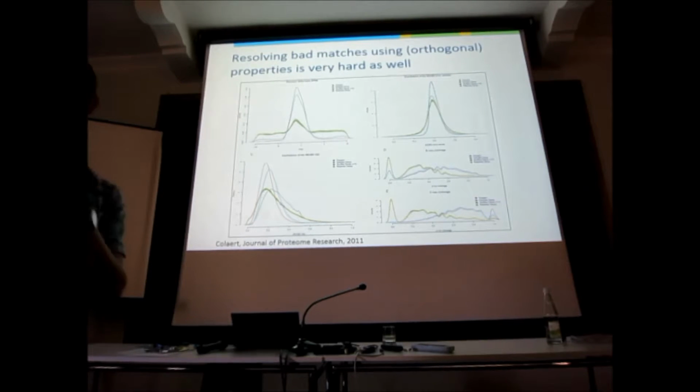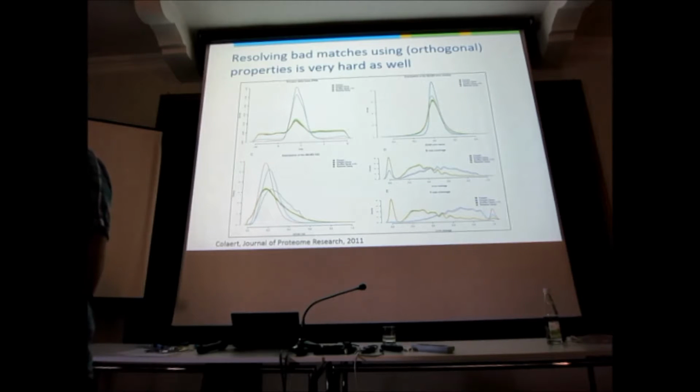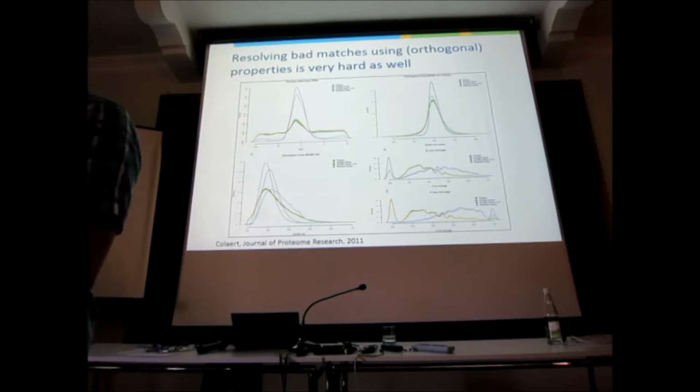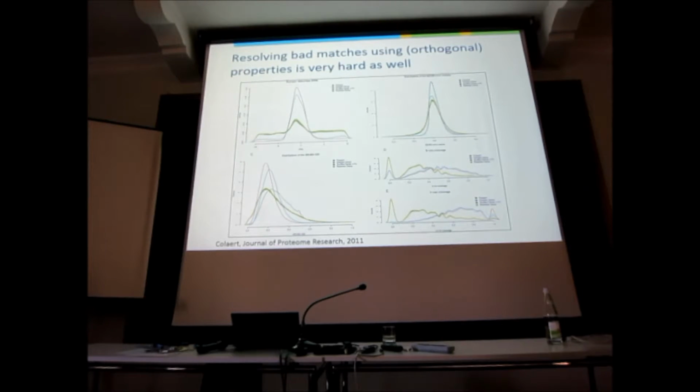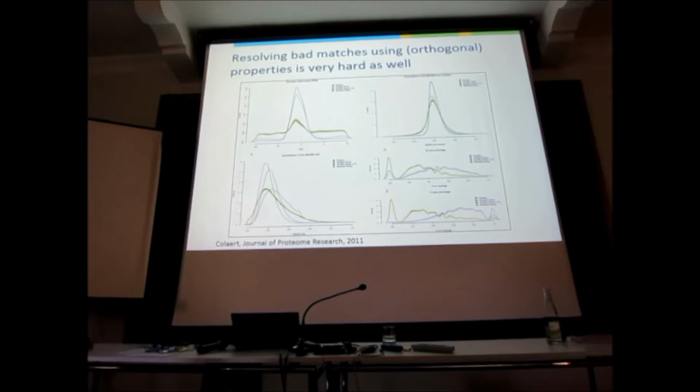Now, we have tools like Percolator. Who knows about Percolator? Did John talk about Percolator? He should, because it's built into Mascot. It's really, really good. You want the search engine to beat today, it's Mascot plus Percolator. It's extremely good. And so, Percolator looks at all these features, right? Has he talked about that, features? We have all these features.